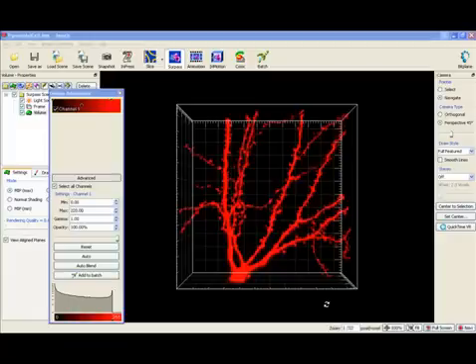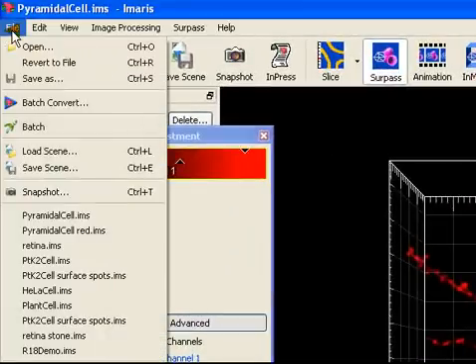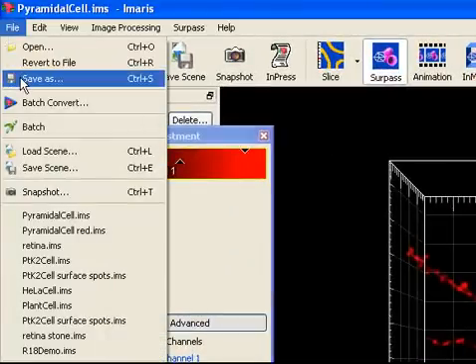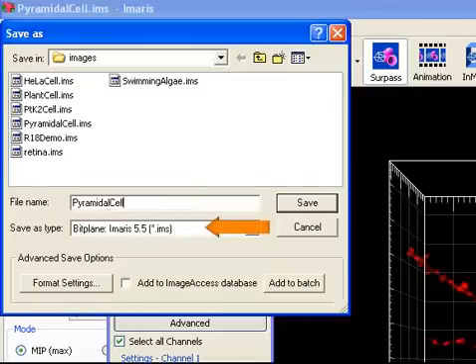When you are happy with your changes the next step is to save the data. In the file menu select the save as option. The image will be saved as an IMS file. IMS is the extension for Imaris image series.